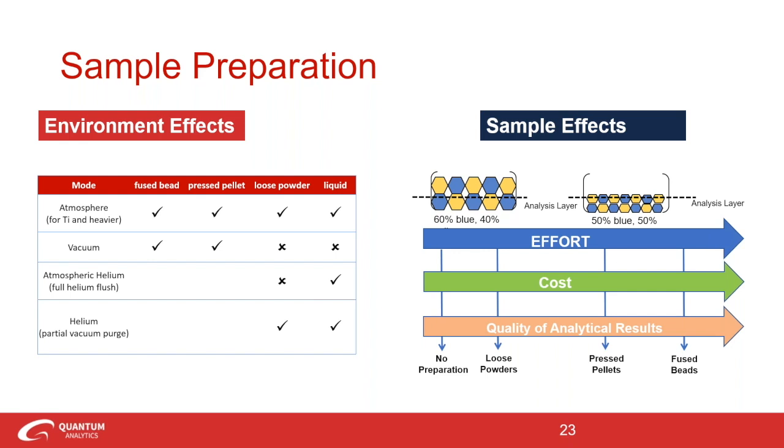I put up this graph here so you can kind of see how there's a correlation between sample prep efforts and cost of some of these efforts, but how the quality of your results will improve with a little bit more effort you put into your sample preparation.